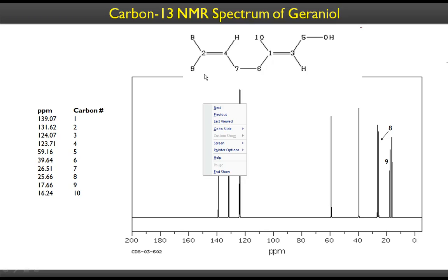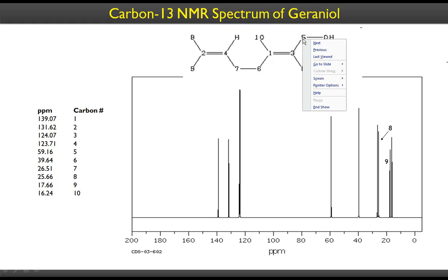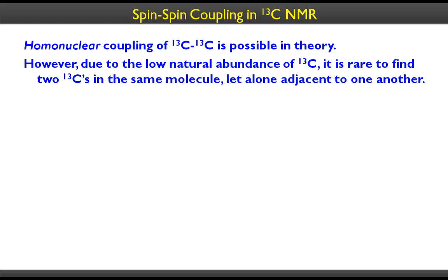Of course, this alone will not tell us; there are other ways of assigning them, but nevertheless, by looking at the chemical shifts and the atoms attached, for example, this carbon is attached to oxygen, so that is this carbon, and this carbon is attached to an alkene, so that's probably a little downfield. So by looking at the structural features, hybridizations, and the atoms attached to the carbon, one can analyze the chemical shifts of a given carbon NMR.